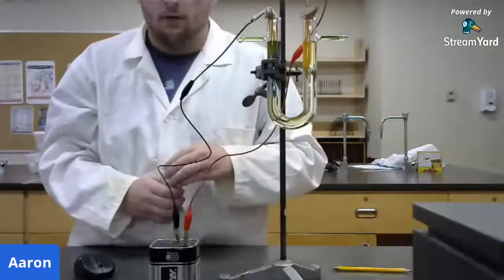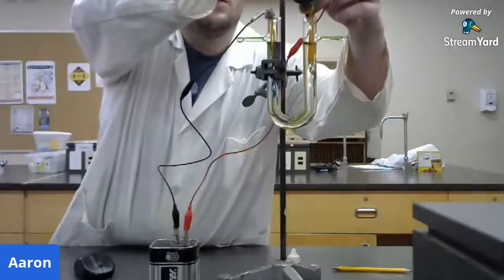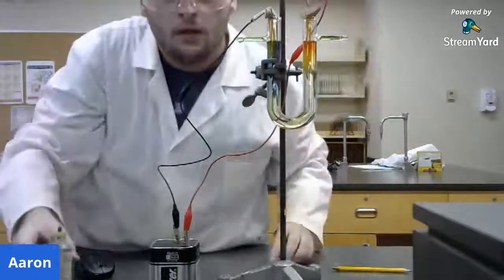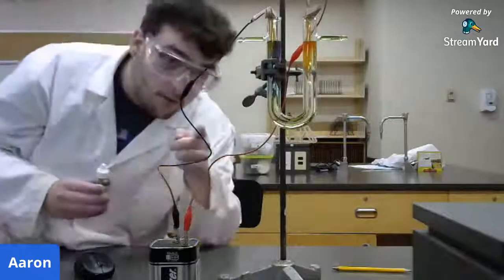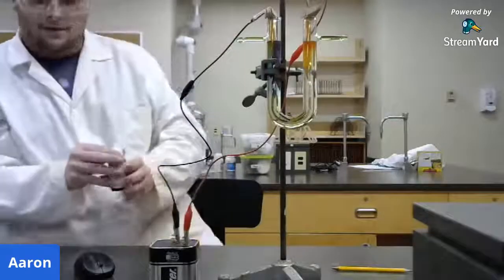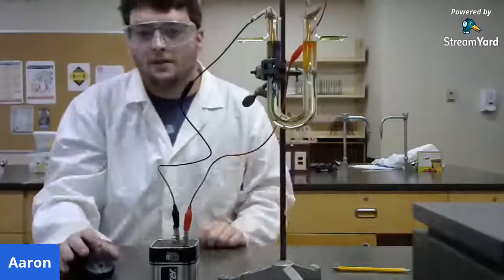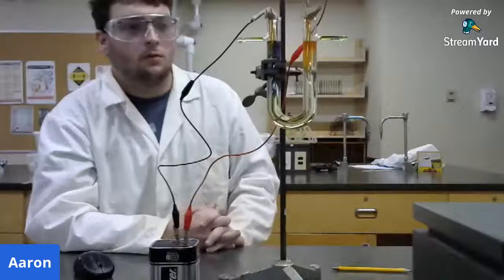So let's toss in a little more indicator, just so we can see this side a little bit better. Oh wow, great, perfect. Never give up, kids. So there, and now it's a completely visible redox reaction.